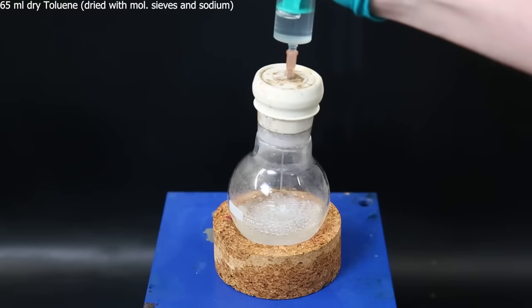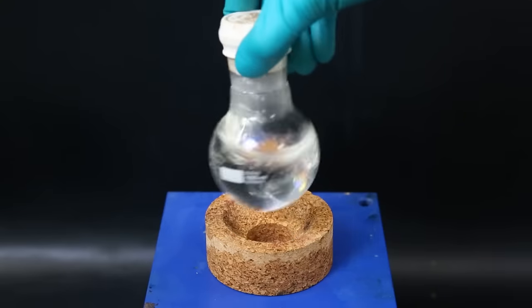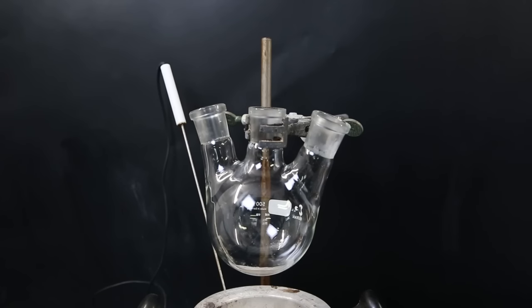Now to the flask containing the bulk of the tin 4 chloride, I inject 65 ml of dry toluene and then mix it around. I put it on the side and can now start the next step.